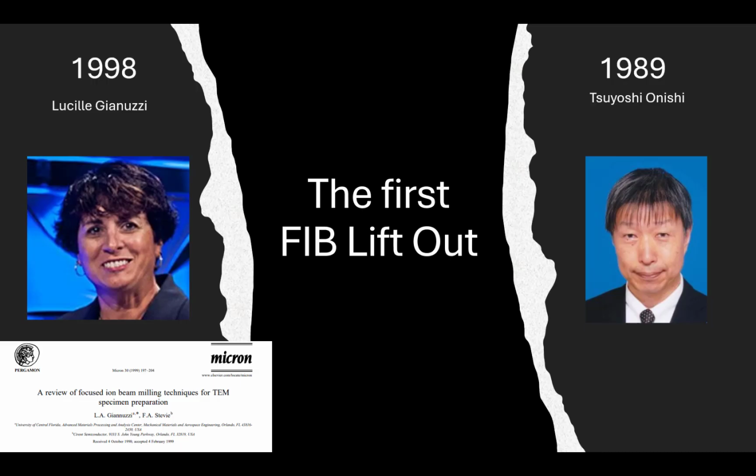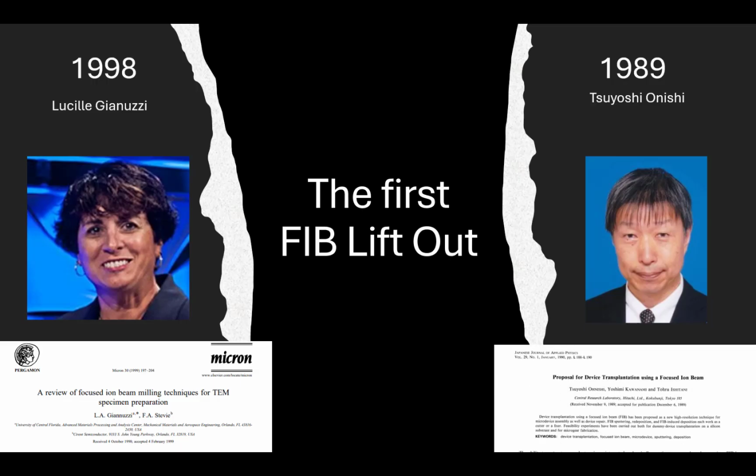And I looked into this and I found his paper published in the Japanese Journal of Applied Physics. And sure enough, he was doing FIB lift outs nearly a decade before anyone in the US thought to try this technique for TEM sample prep.